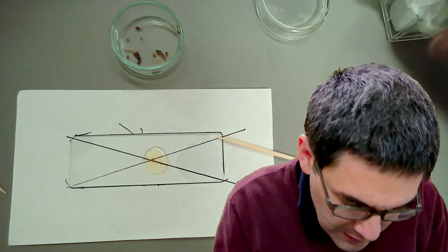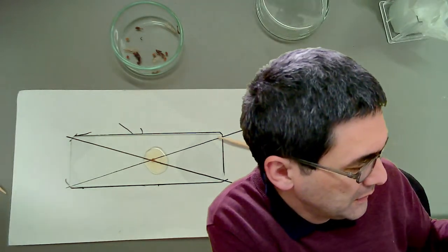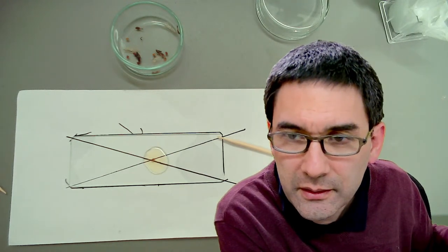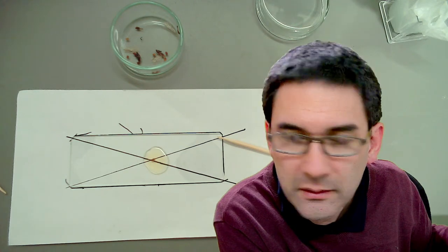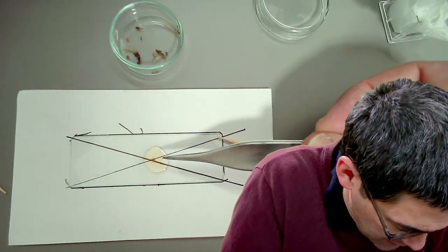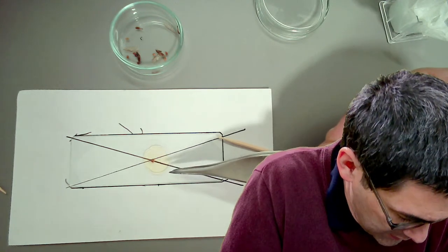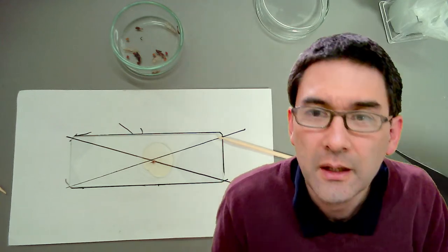And again, a cover glass. I have to wipe it again. And let's give it another try. So let's place it again on here. Okay, here we go. Now it stays kind of in the middle. It's fine.